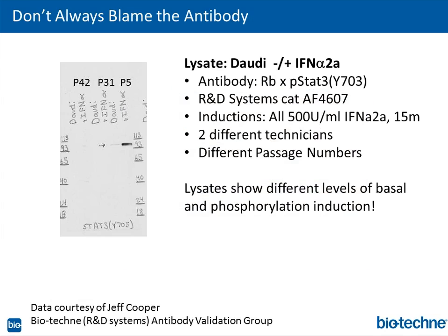Now, I want to show you some more powerful data. We talked very early on about lysates and sample prep, and this is a very overlooked area. And I got a lot of this data, by the way.